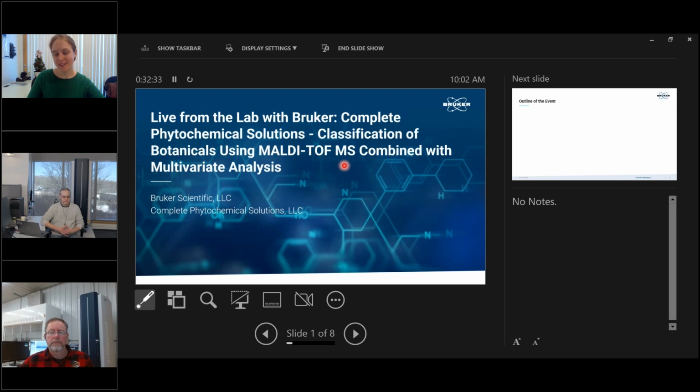Today, we will be talking about the classification of botanicals using MALDI-TOF MS combined with multivariate analysis. Today, you'll be hearing from Mark Arnould, live from the Bruker lab, and Christian Krueger, live from the Complete Phytochemical Solutions lab. Mark Arnould is a senior application scientist within the Applied Markets division at Bruker. With a concentration on polymer applications, he has over 20 years of experience analyzing synthetic macromolecules using mass spectrometric methods.